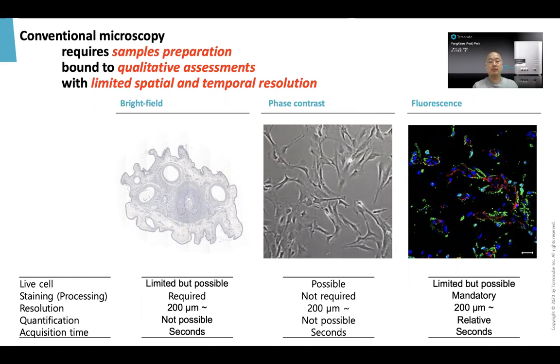And even though they can provide very valuable information of cells and tissues, they have several limitations. First, you have to worry about sample preparation. The typical procedures for microscopic sample preparation usually require fixation, staining, or the introduction of exogenous labels such as dyes, or sometimes you have to make the cell express a fluorescent protein by transfection procedures.